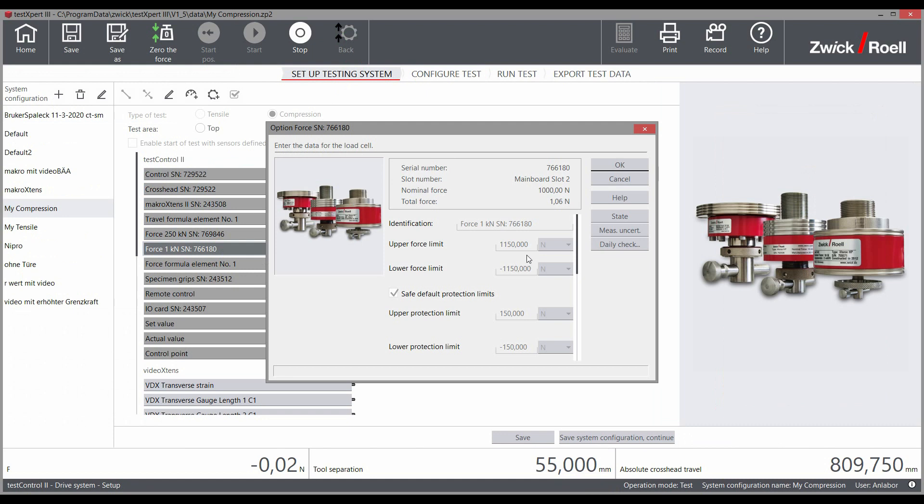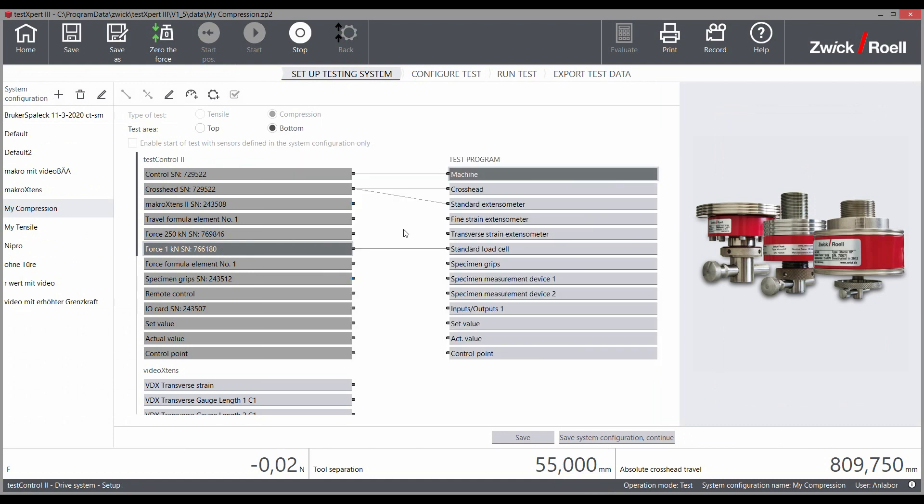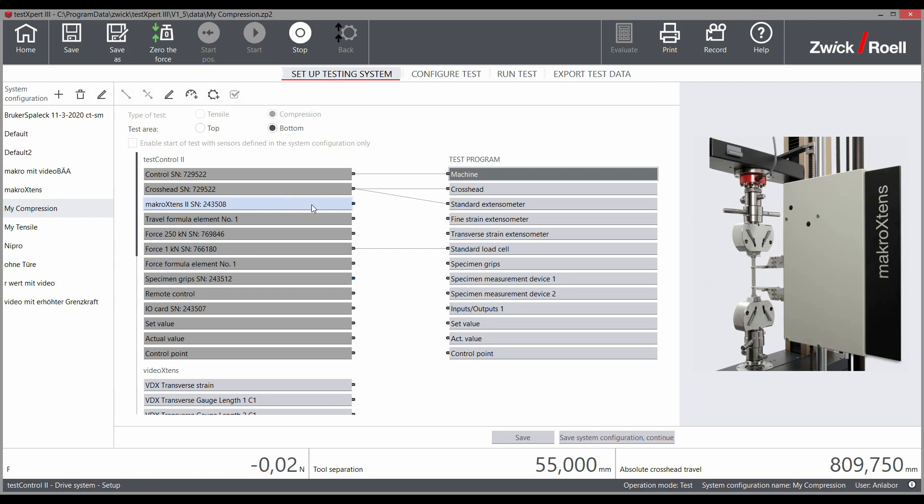Without activating the key switch, you can view the settings; however, you cannot change them.